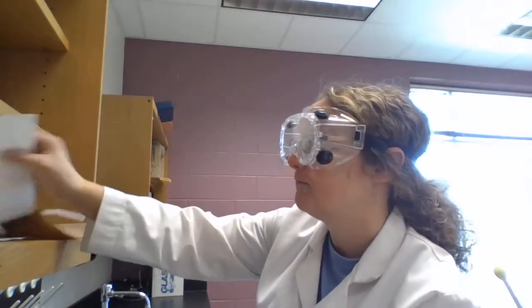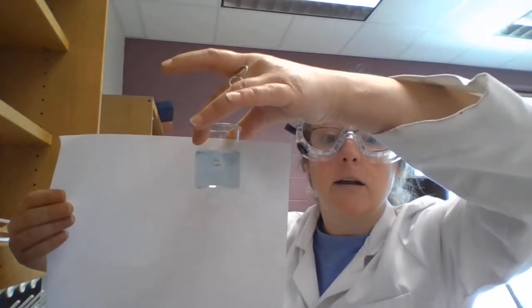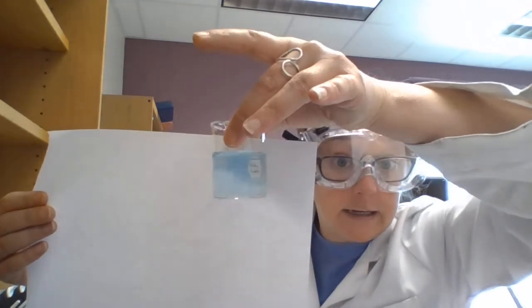And it's kind of hard to see. So I'll hold up a piece of white paper behind it. All right, and you can see here that that is a faint blue color. Now, bromothymol blue does turn yellow in the presence of an acid. So what I'm going to do is I'm going to exhale.